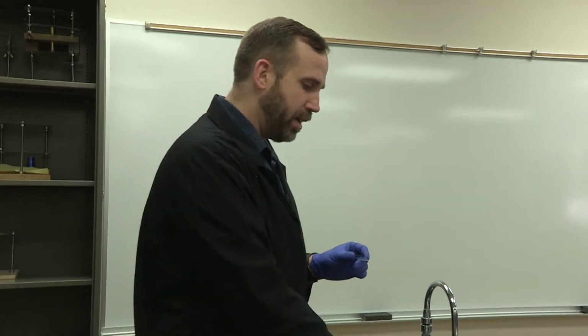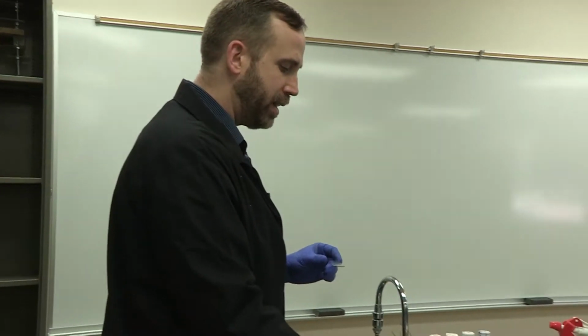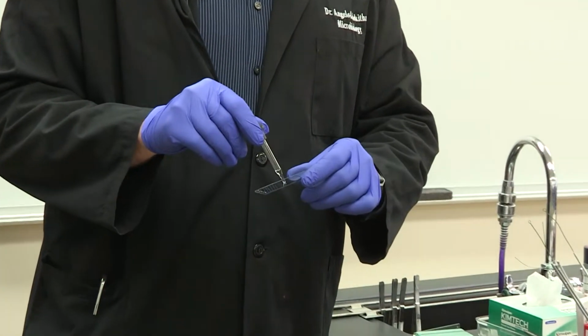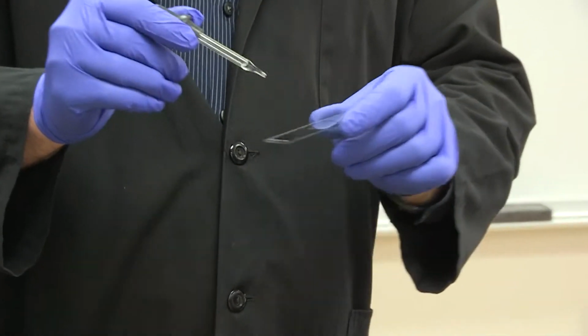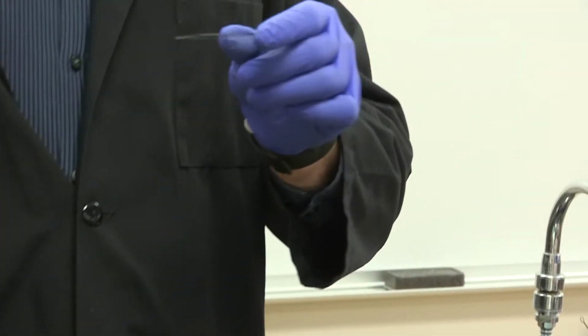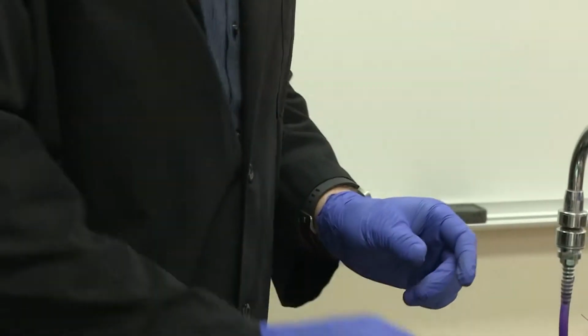Okay? So the next thing we're going to do is we're going to take a small, tiny drop of water. You don't even need to squeeze this most of the time. So a small, tiny drop of water. And that's where we're going to be mixing our bacteria. The tinier the drop, the better.